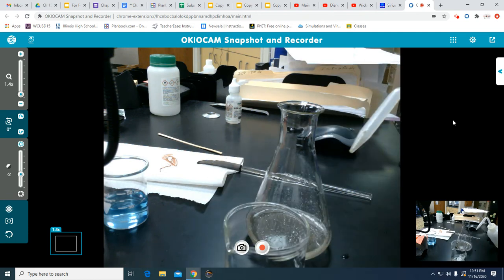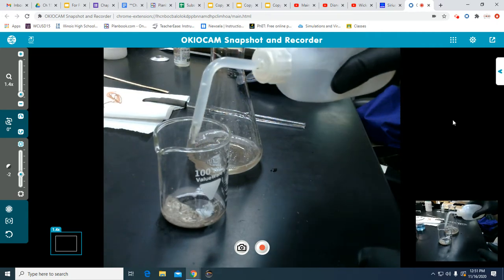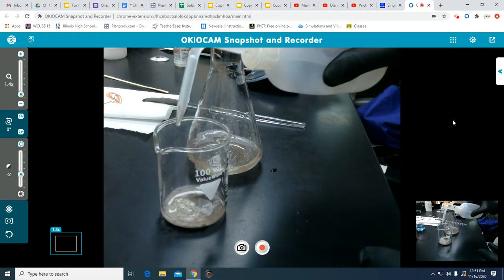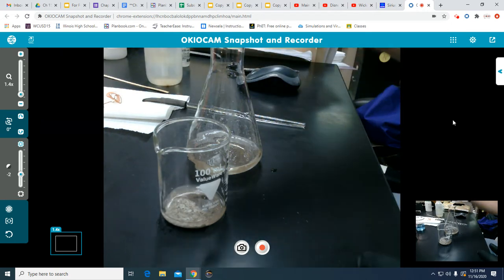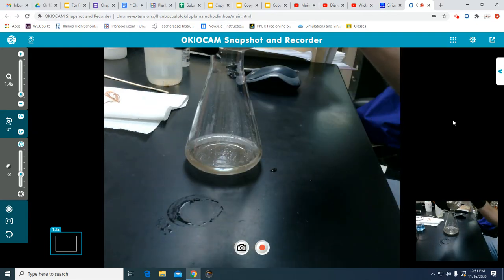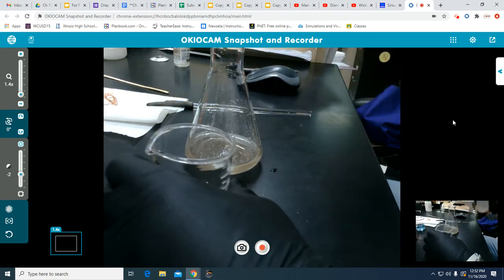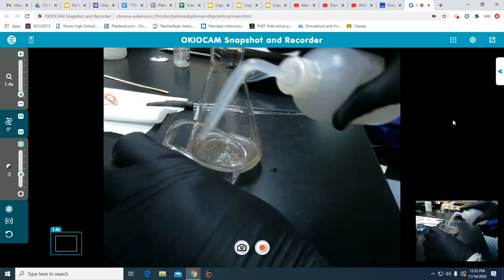Okay, so now, according to the instructions, I've got to spray this down as much as possible, about 5 to 10 mL. We just want to rinse it so we can get as much of the other solution out of here, so we can have just pretty much dry product. And see, I'm losing some, which in the end is going to cause my theoretical and my actual yield to be different. And it says to do it one last time, so we'll do it one last time.